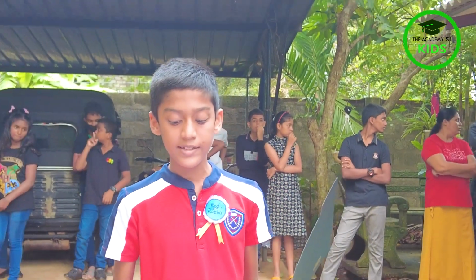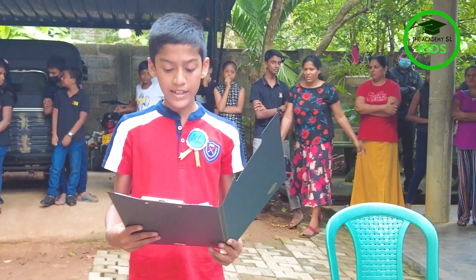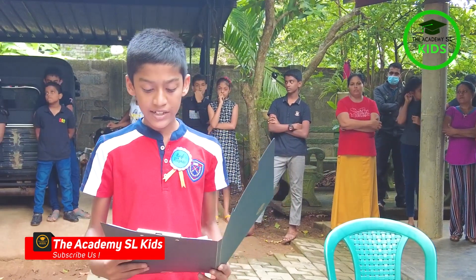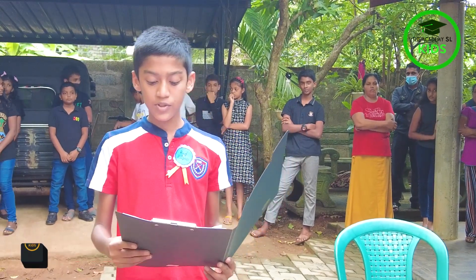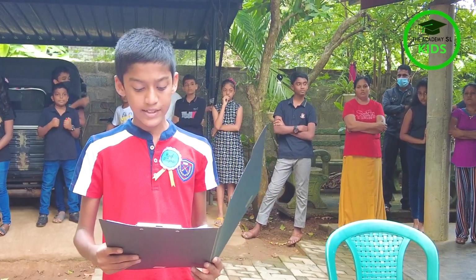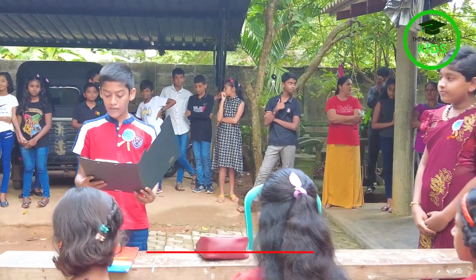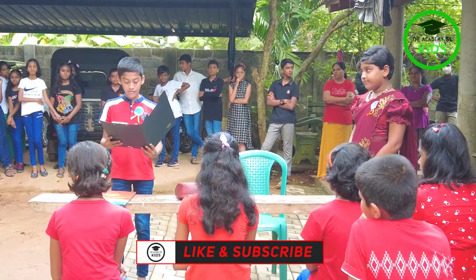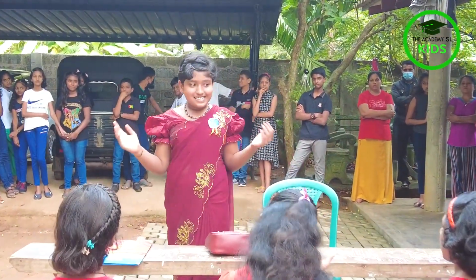If the microscope is not used for a long period of time, the lenses should be removed and placed inside a desiccator with silica gel or anhydrous calcium chloride. The microscope should be stored in an upright position to minimize the accumulation of dust. Use clean slides and cover slips in the observation. Do not change the lenses of one microscope with another. Very good. Those answers are correct.